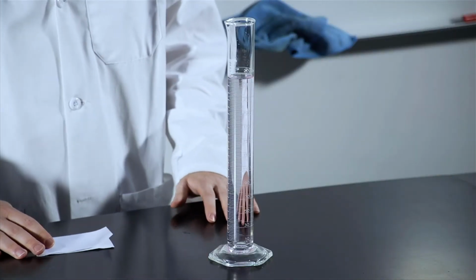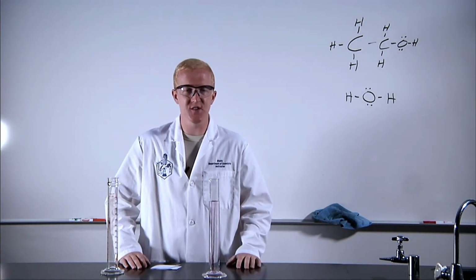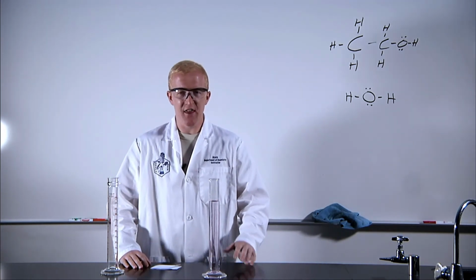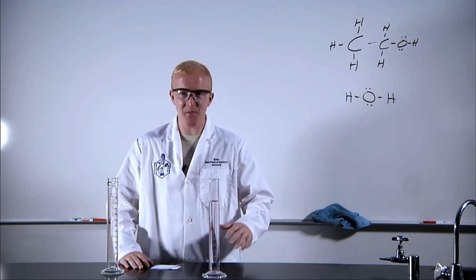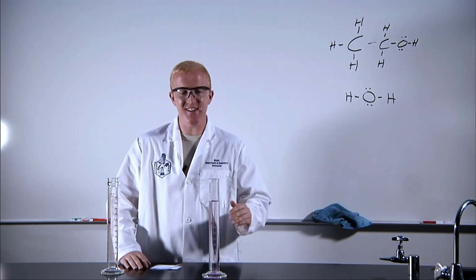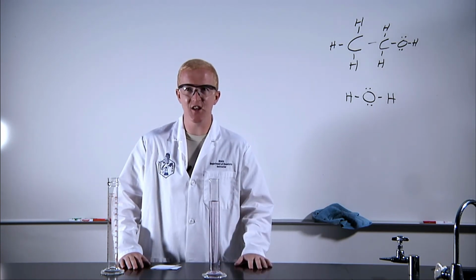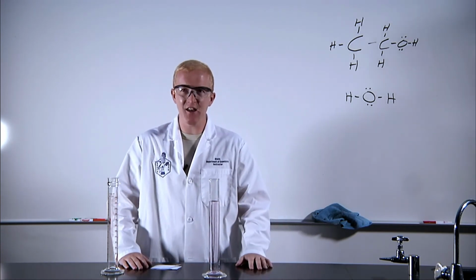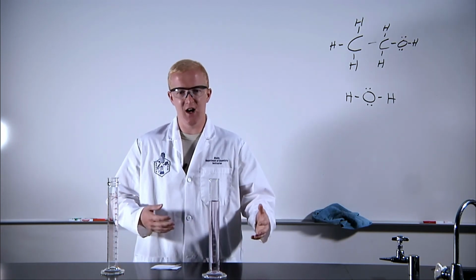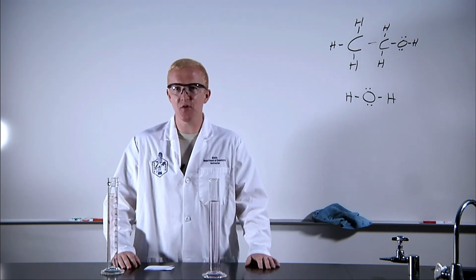247. What's happening here is really an argument of intermolecular forces. When we mix these two things, we're actually disrupting the hydrogen bonding and some other things happening within both structures. And what that causes is this volume change. We see a decrease in volume because of this interaction. This is the simplest way that I know to really illustrate how those forces interact with each other, and how they can affect something simple like volume.